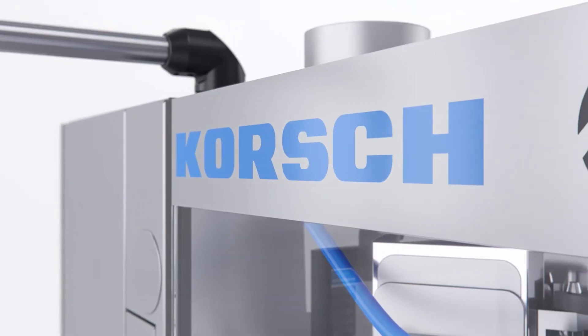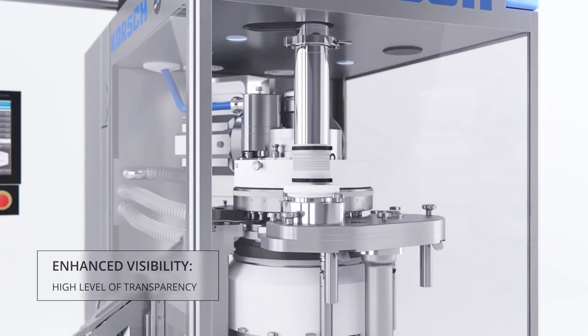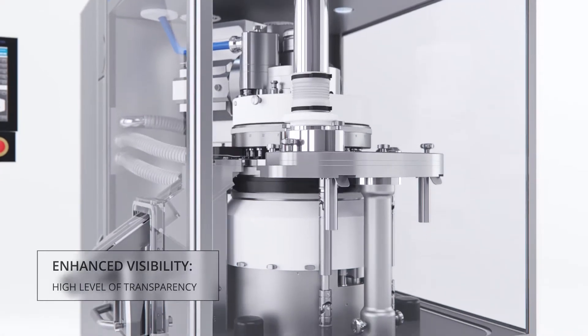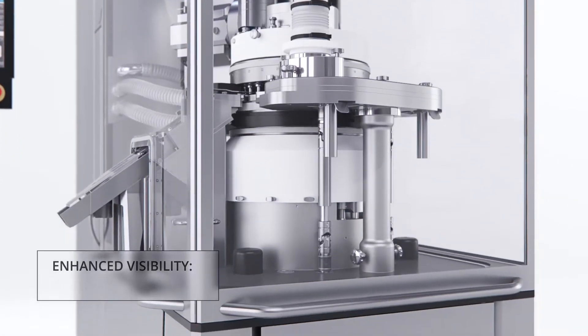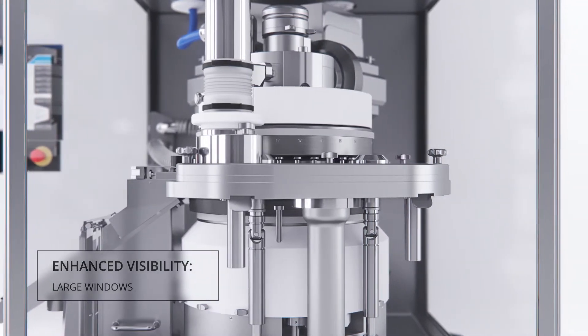The X3 leverages the combination of form and function to maximize performance. Our design eliminates the use of corner columns, resulting in unlimited access to the press zone. The large windows offer excellent visibility.